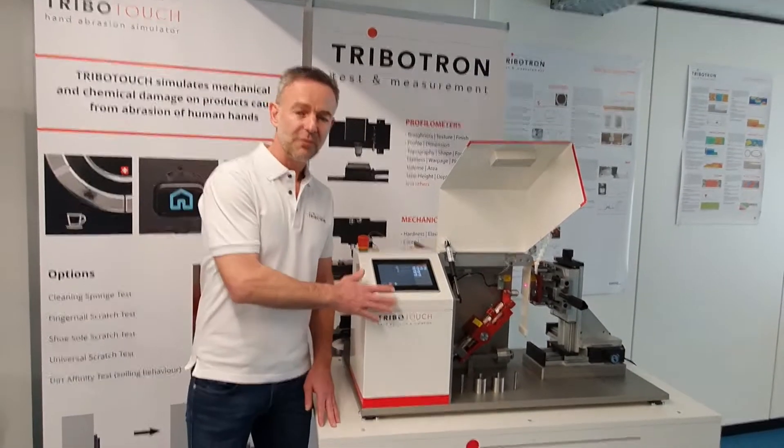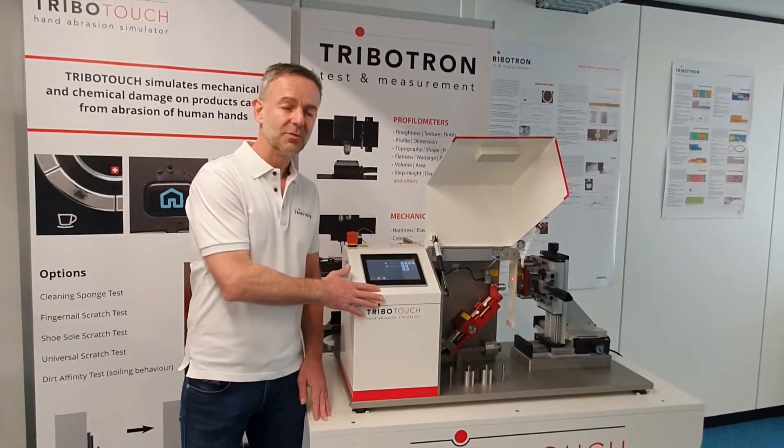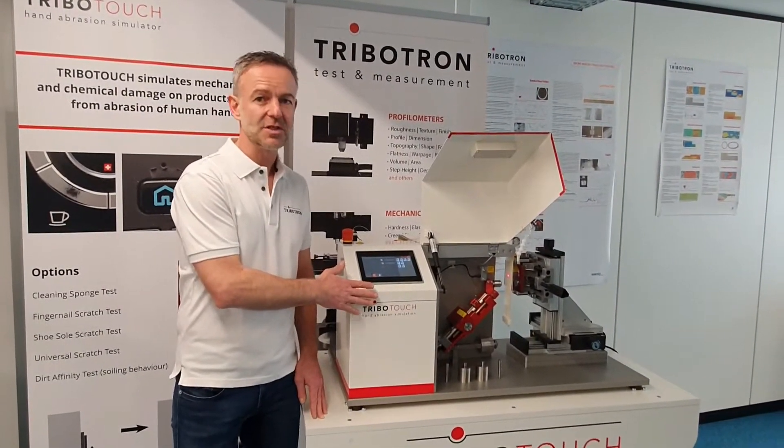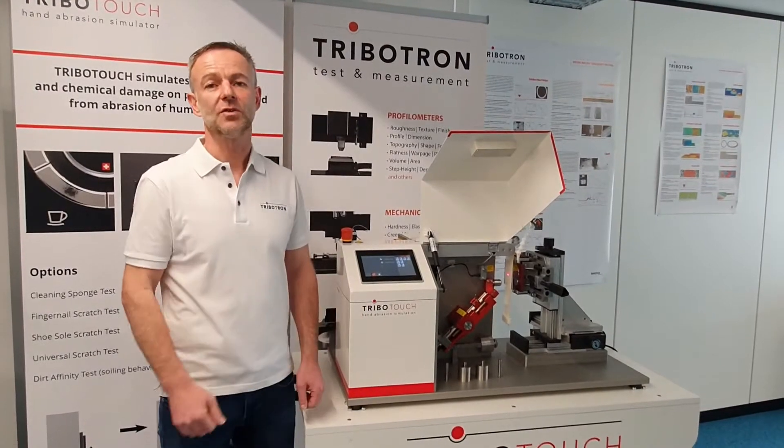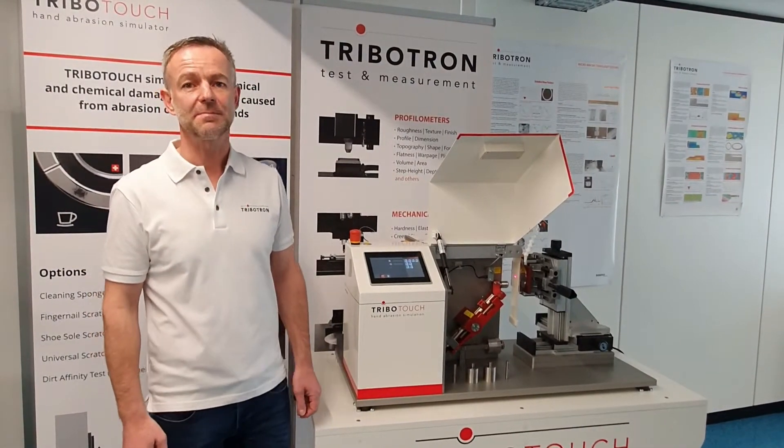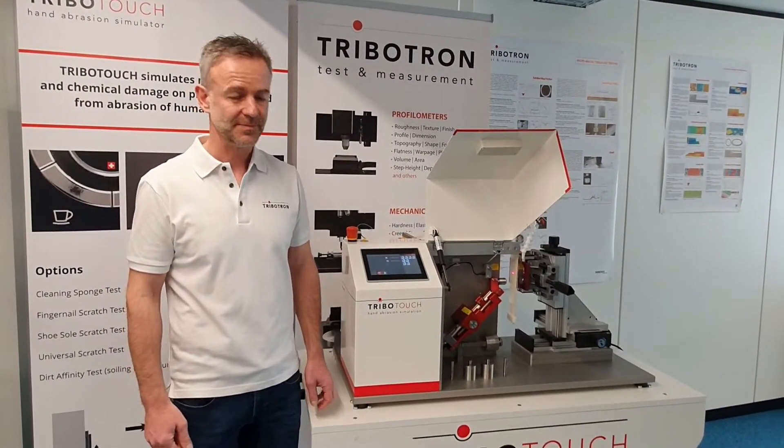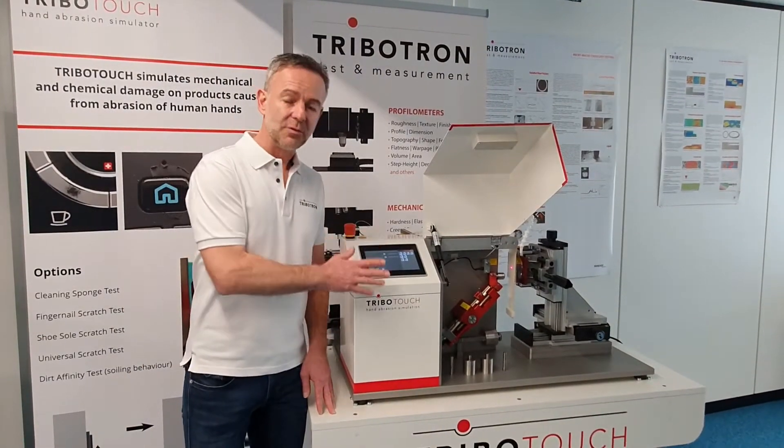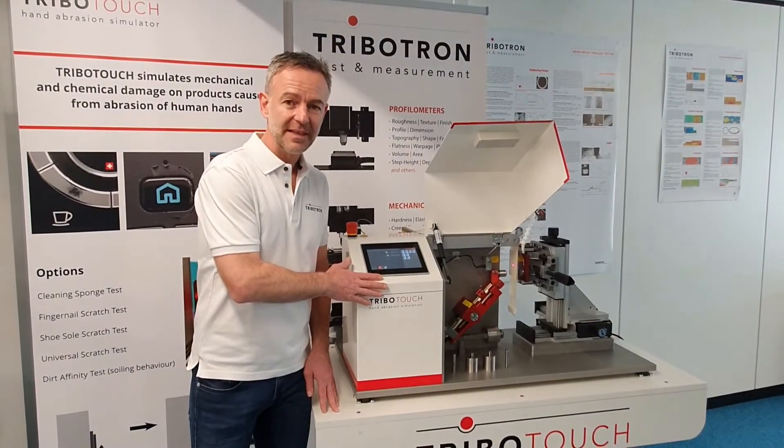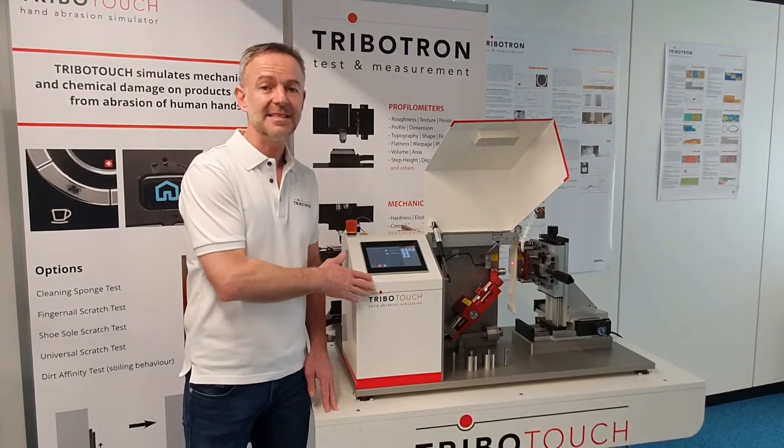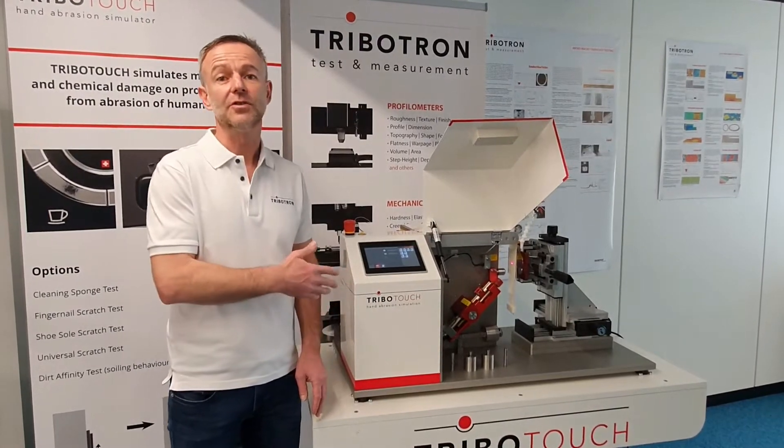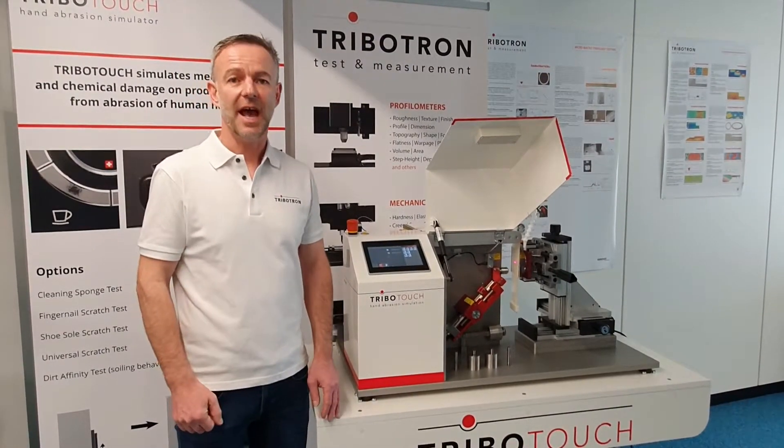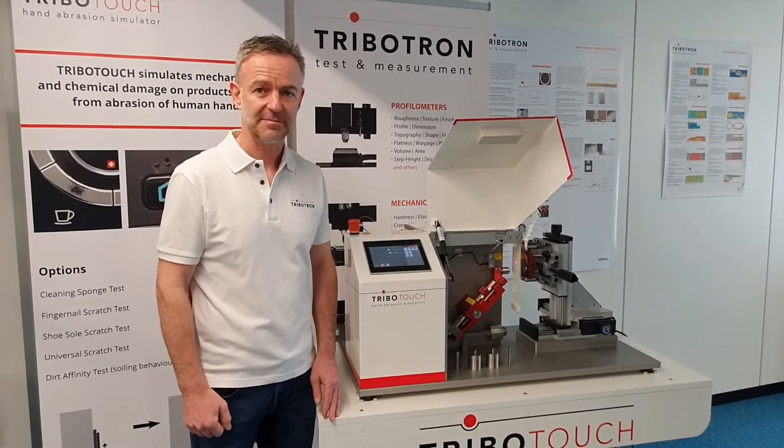We have performed the test with the Tribotouch test instrument which is working according to an IEC environmental specification. The Tribotouch instrument is ideal for mar testing as it allows the determination of visual changes after mechanical stress.